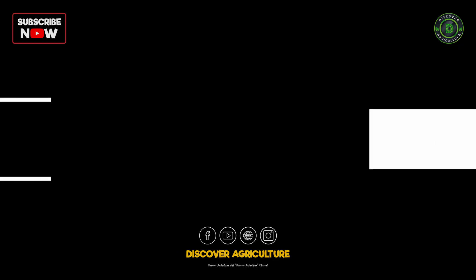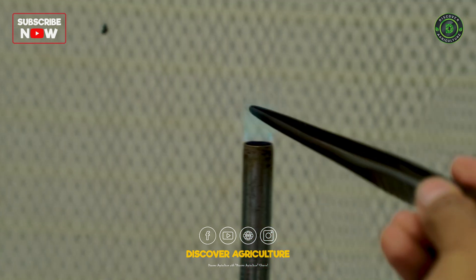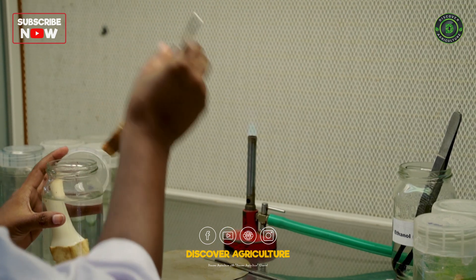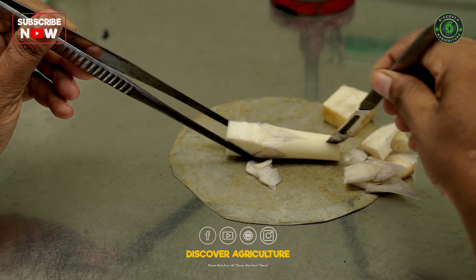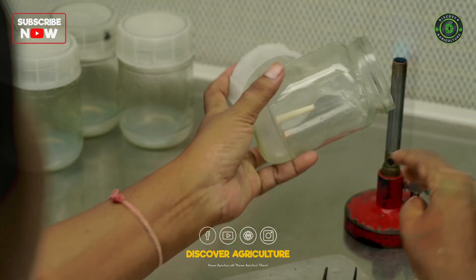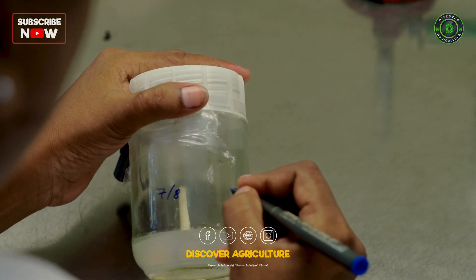Sterilization of tools and explant. During the process, we sterilize both the plates and forceps to ensure a contamination-free environment. Once sterilized, the 5-7mm shoot tips are excised from the rhizomes, trimmed to remove outer coverings, and inoculated into the initiation media. The jar is immediately sealed and labeled with the inoculation date for future reference.